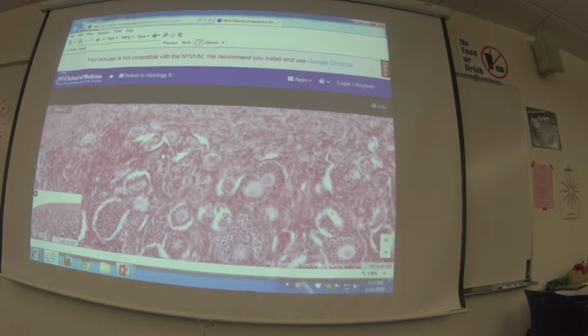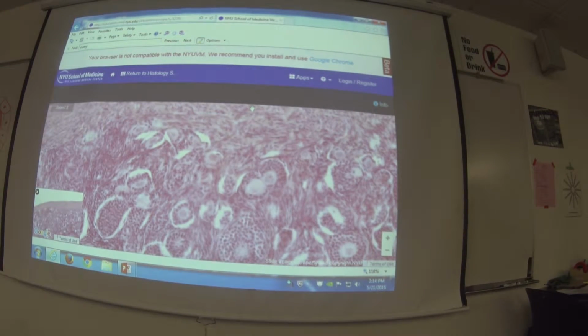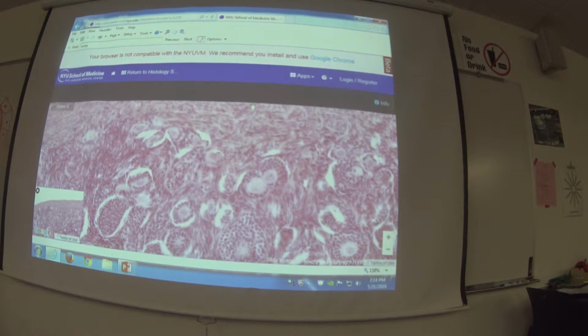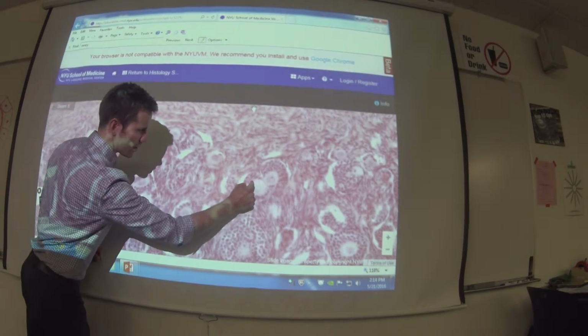A lot of oocytes in here. So if you notice, the size is really unique. The oocytes are huge cells. All these little dark dots, those are normal sized cells. The oocytes are monsters. Huge, huge cells.